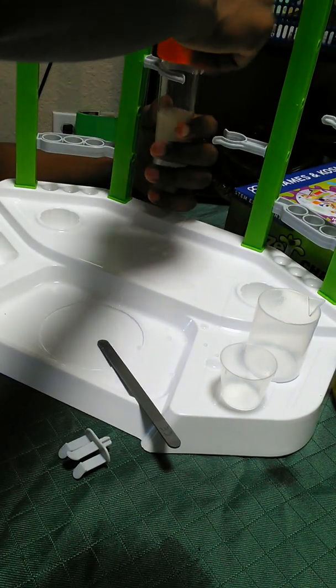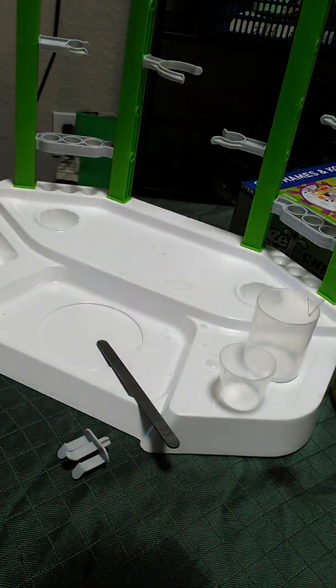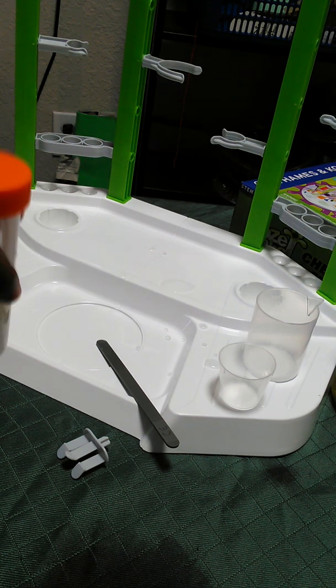Are we supposed to shake it vigorously? Upside down. I mean up and down. So it said screw the lid. Yeah, shake the contents. Bro, it just says shake the contents. What did you just do, bro? Shake the contents until the oil and water appear to be mixed.